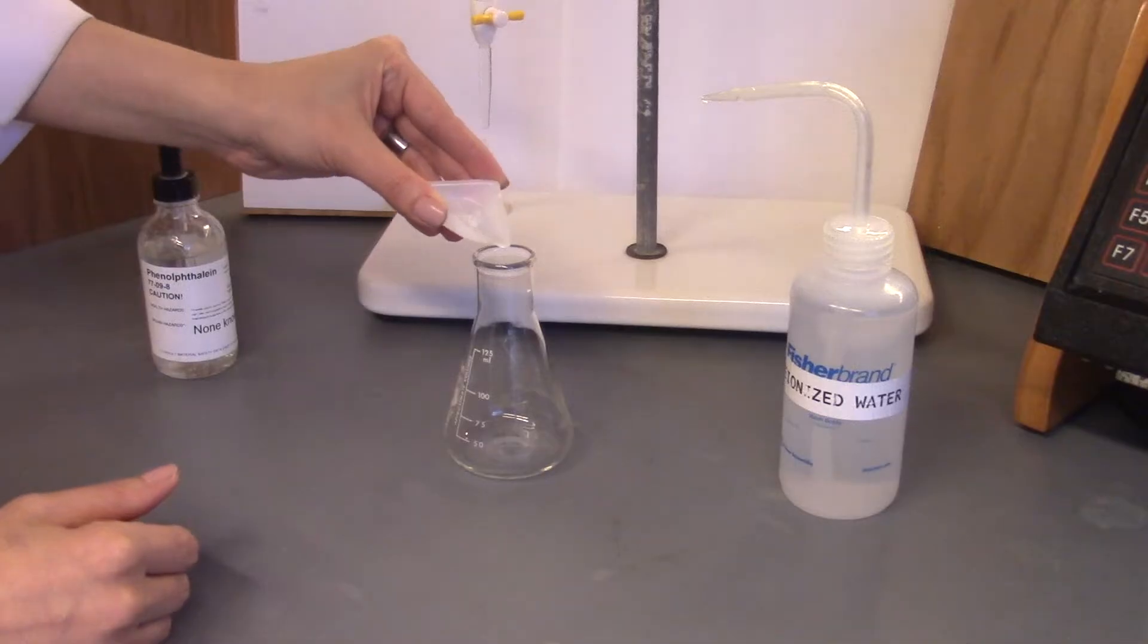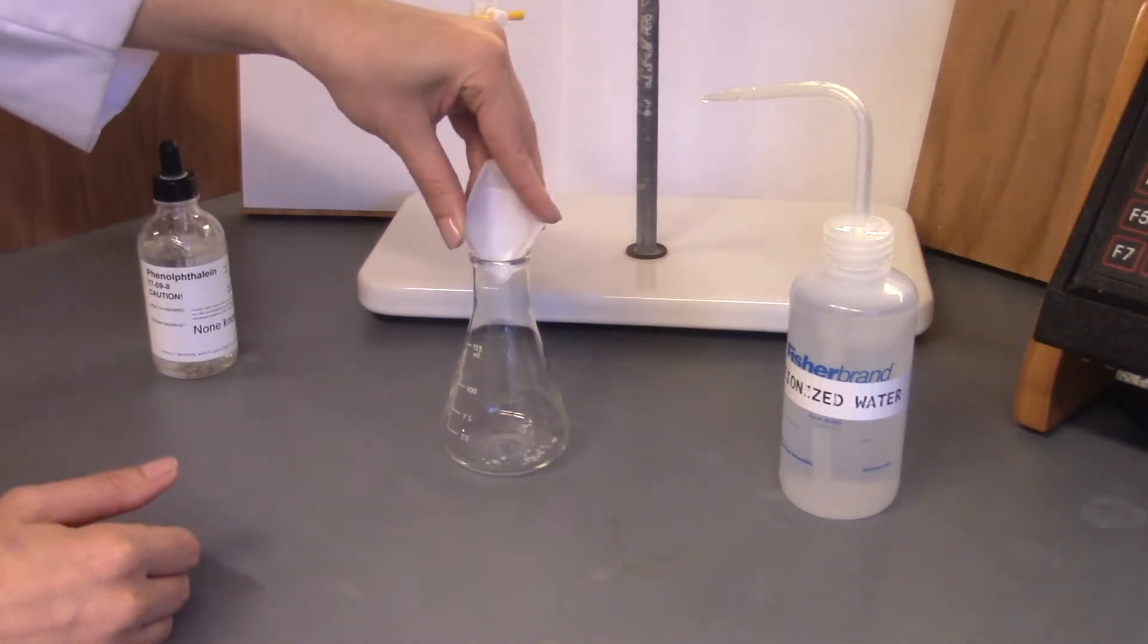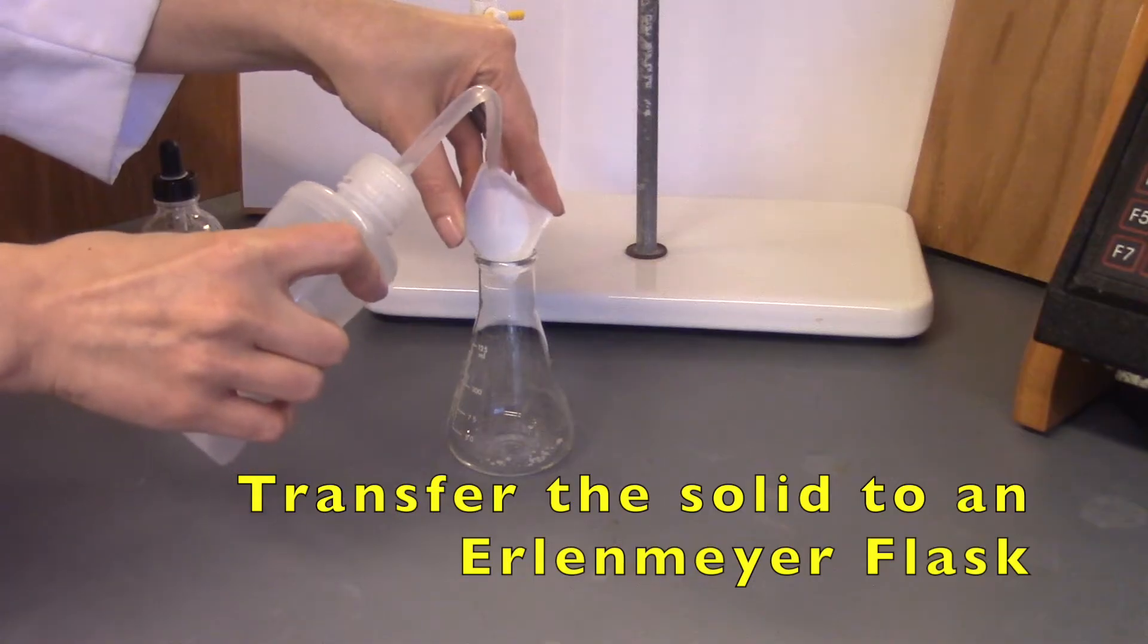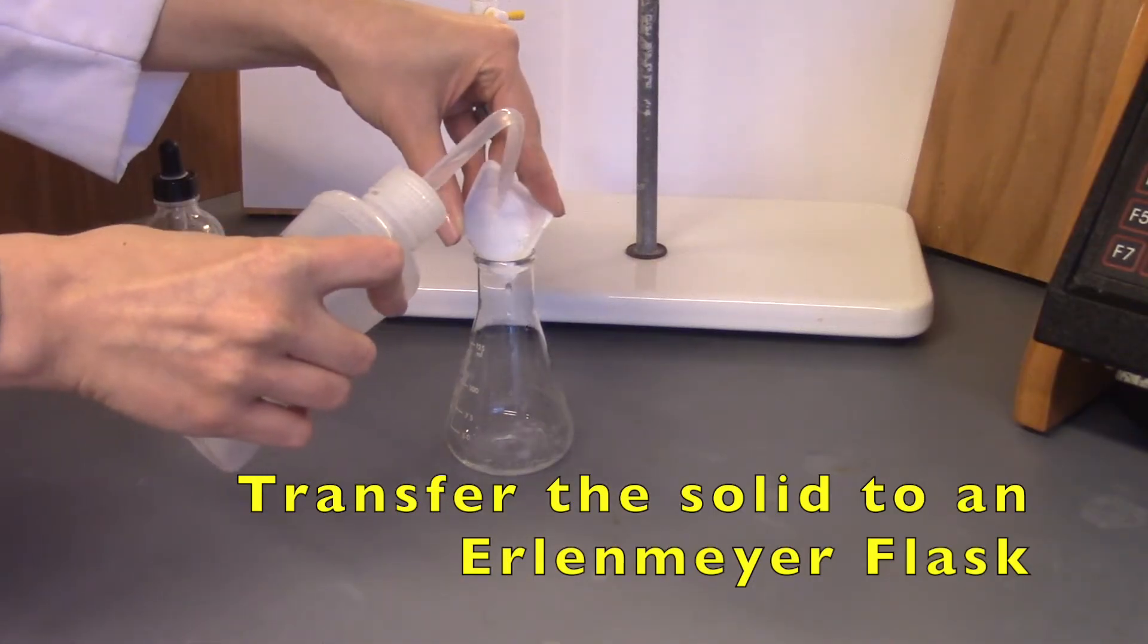Transfer the solid from the weighing boat to the Erlenmeyer flask. Rinse the weigh boat thoroughly with deionized water to ensure quantitative or complete transfer of the weighed solid to the flask.